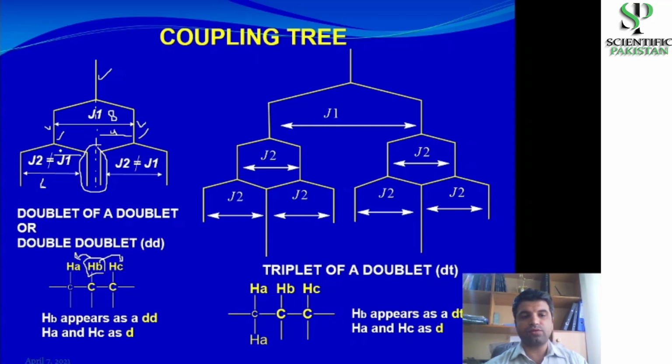So when they move 3 hertz to this side, they do not reach this center, because this center is at a distance of 4 hertz from this line or the center of this doublet, right? So we still have 1 hertz of gap between the center and this line.